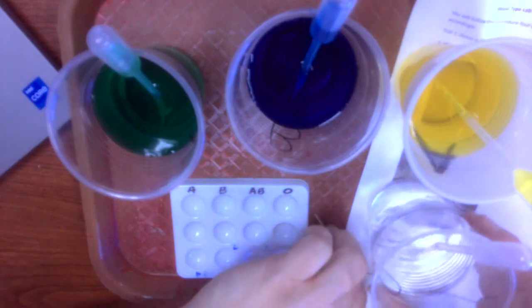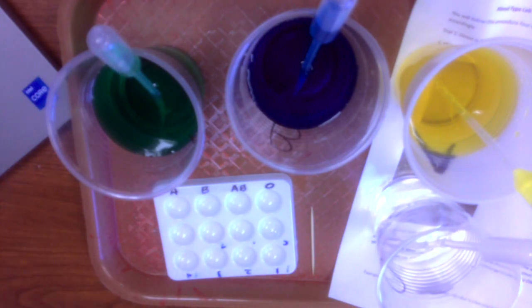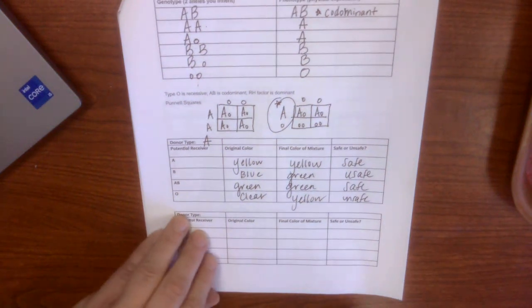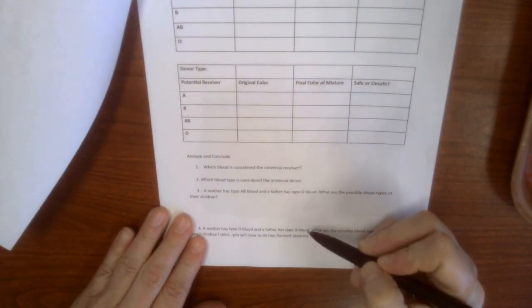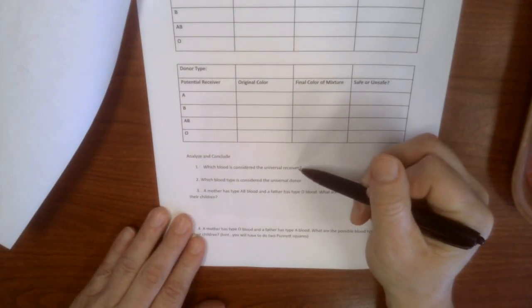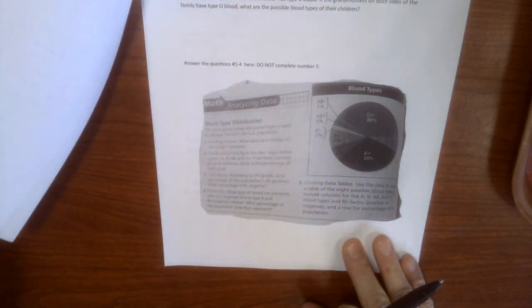Shouldn't have a whole lot of spillage. Be really, really careful. Once you finish, move this out of the way. Okay. So once you finish all of your donors, you're going to go through 4 times. You have some analysis questions. You should determine who's the universal receiver, universal donor. You've got some questions there.